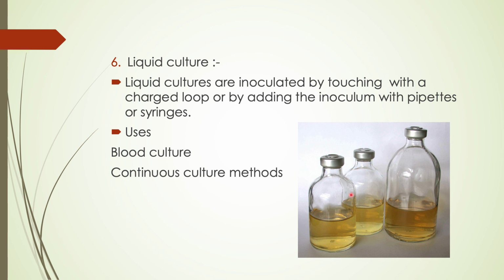Without touching the media, you just insert your needle here and that's it. Insert your needle, pour your sample, and incubate this. And the use of this culture is for blood culture. Thank you very much.